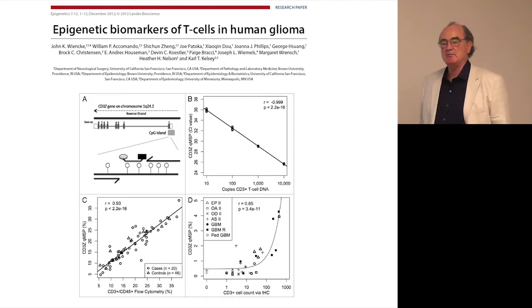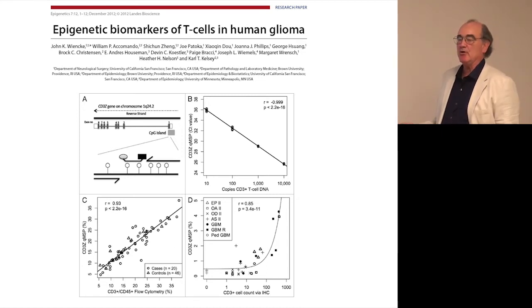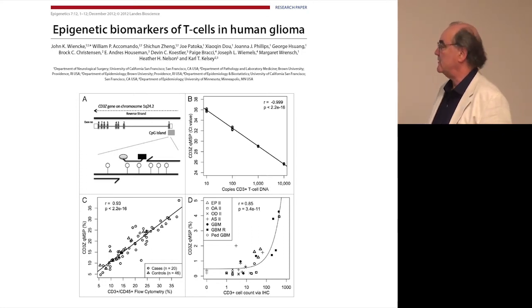I'm not going to talk about the tumor studies. But in the process of doing this paper, we got really frustrated with qPCR. Over time, when we do a lot of experiments on different individuals, we're trying to keep the standard curve behaving itself. And at low copy numbers, we have a lot of noise, let's just say. That was a couple years ago, so we were really happy to be able to try another approach, and that's what I'll show you.